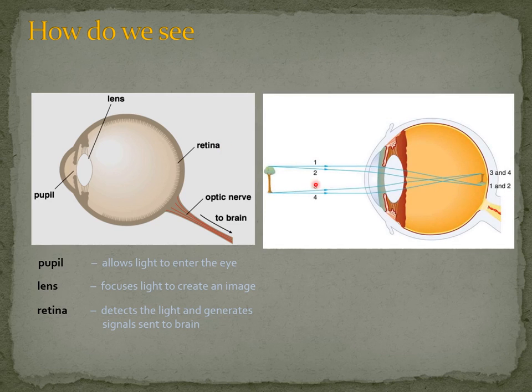The light rays that come from the object that we observe will be focused by the lens on the retina, but the image will be seen upside down. For the purpose of this talk, this is not really important, but when building a microscope, and if we want to create an image that truly reflects the position of the object being seen, this can be one important detail.